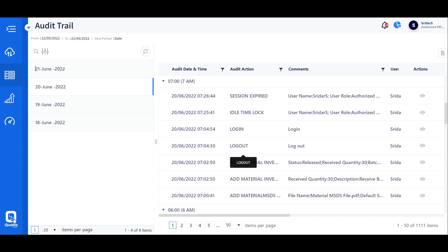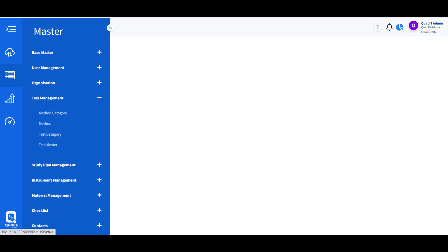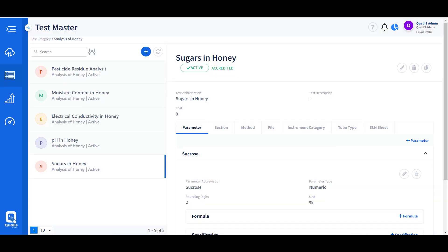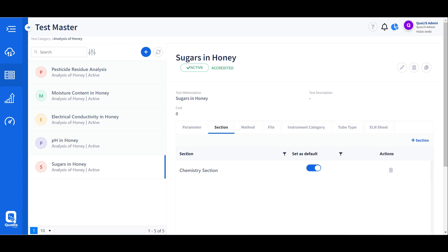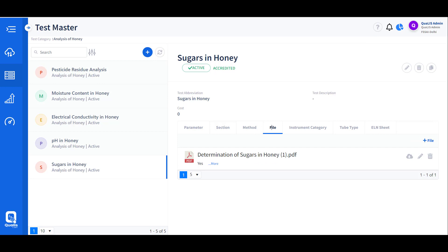Test master allows categorization of tests based on work areas or techniques. Tests are defined as a single master and then associated with products. While defining the test, the appropriate section is identified, which controls work access based on section users. Methods can also be associated and referred to while working.